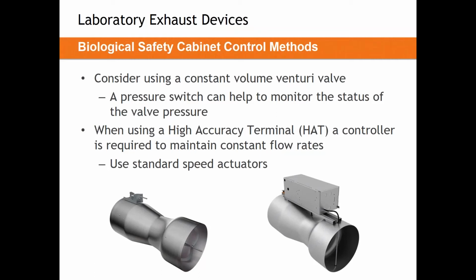Your third option would be just to connect the bio cabinet directly to likely a dedicated fan. That can work. However, it might be a little tougher to control. It might be a little more complicated on the fan side. Introducing an airflow control valve can keep it actually a little bit more simple.